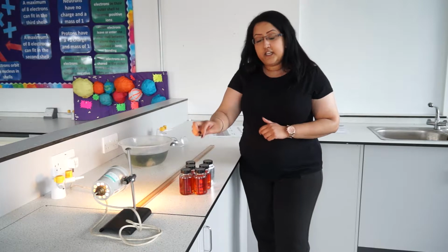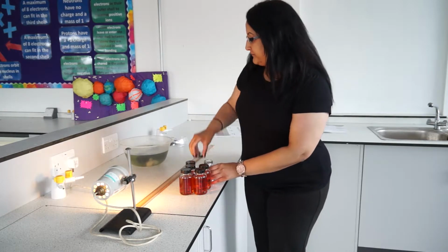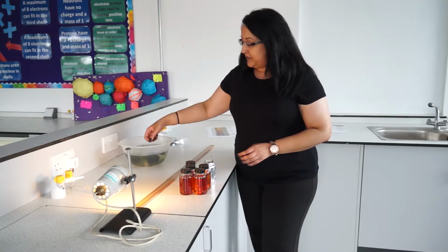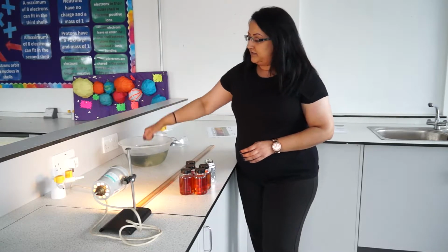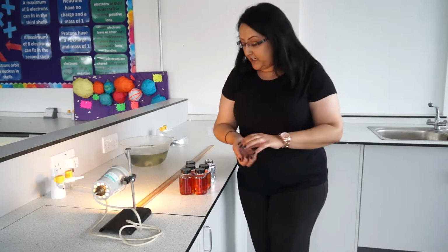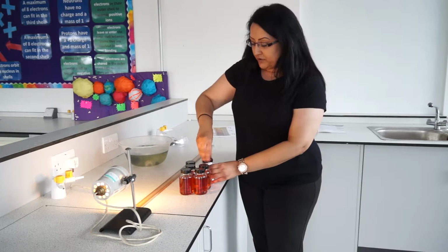Now what you need to do is add, I've got some chopped up already, 2 pieces in each of the bottles that are about that size. So you add 2 of those in each bottle.